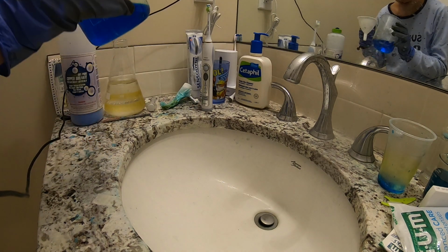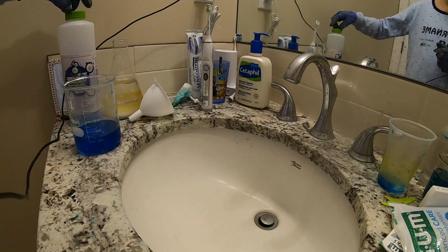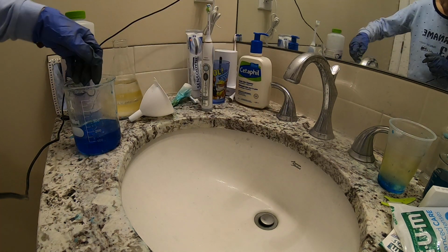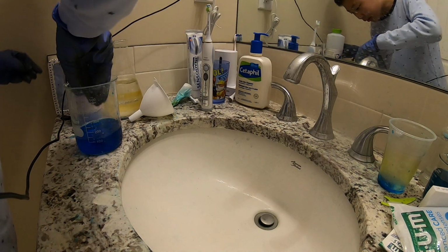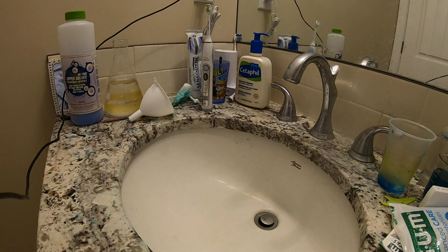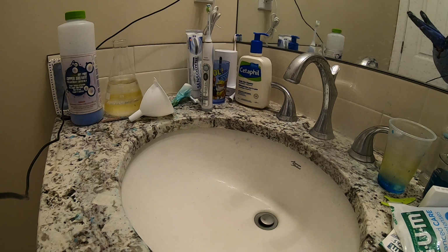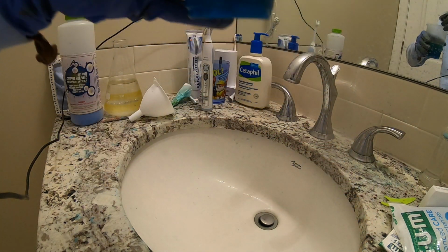So there, nice and clean. So I'm going to plop the crystal back in. I'm going to push it there. Alright. I'm going to recover it with the paper towel. So, there. All done. And before I get to my explanation, I need to get this back in there.